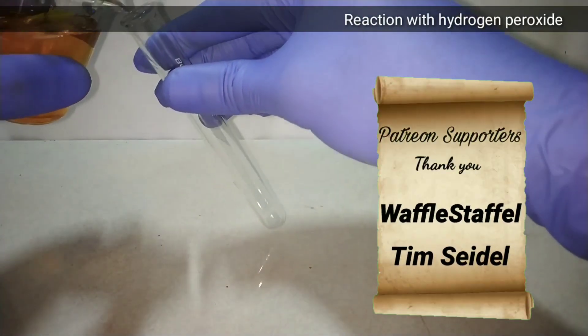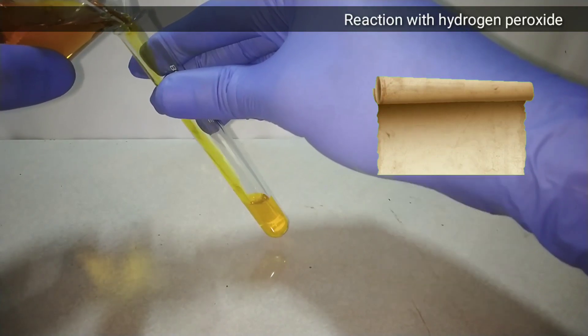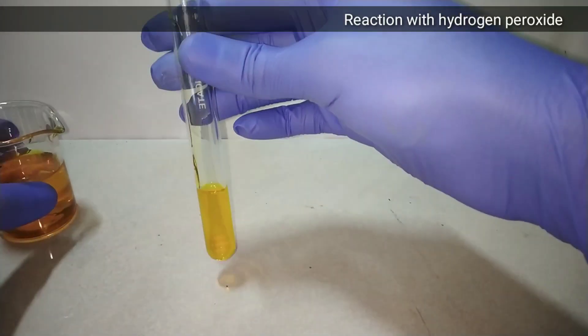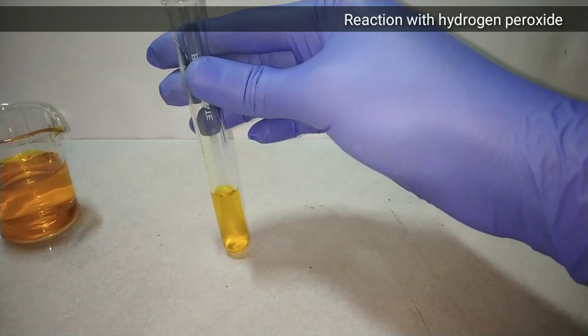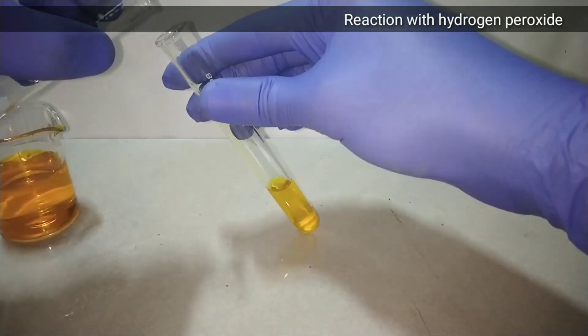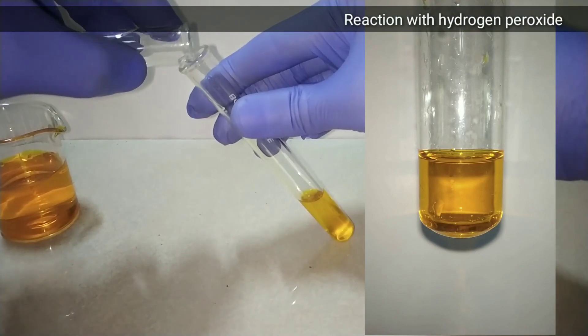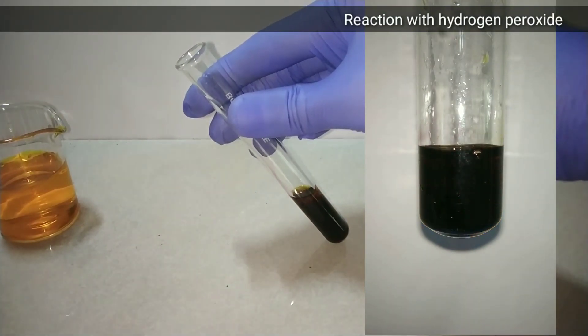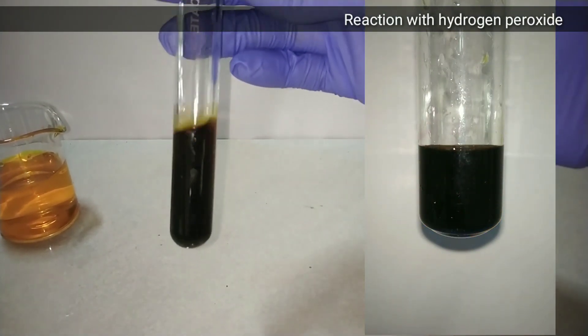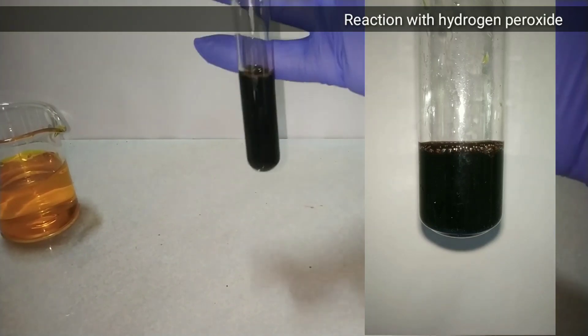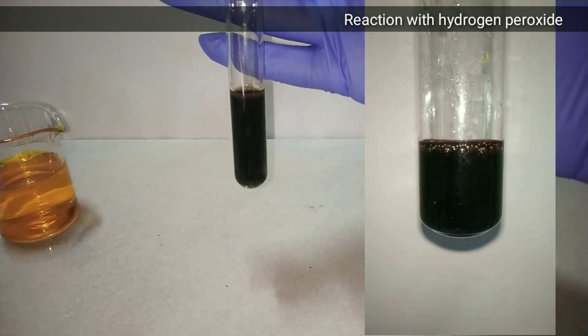Now let us see some reactions with ammonium dichromate. First of all we will be seeing the reaction of ammonium dichromate with hydrogen peroxide. On adding the hydrogen peroxide there is formation of a dark blue colored chromium peroxide formed. There is also a brisk effervescence seen due to release of oxygen gas.